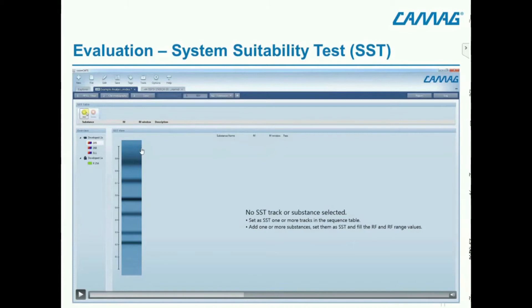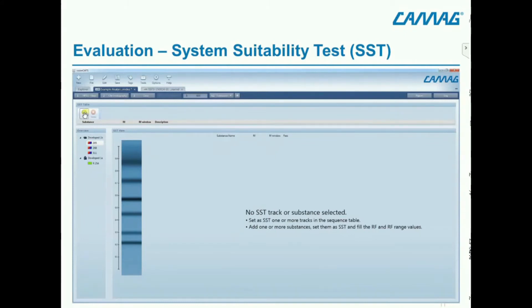If you look at the image, you will see a green track with the fluorescence quenching zones. There we add the substance, the reference, the name of the reference, and enter the RF value plus the acceptance criteria — the tolerance of the RF value. We have a recommendation from CAMAG.